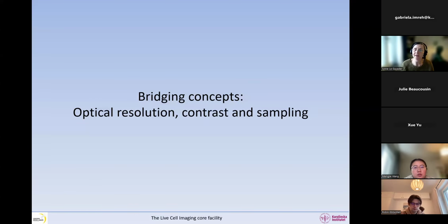And we're going to add a little bit with how we split the colors and things like this today or tomorrow, I can't remember. And then we spoke a lot about objectives because these are central for imaging and how we choose an objective. And also yesterday, or no, on Monday, we spoke about sample preparation quite a lot. So today and tomorrow, we're going to talk about digital images and how to capture light. So these two modules really hang together.